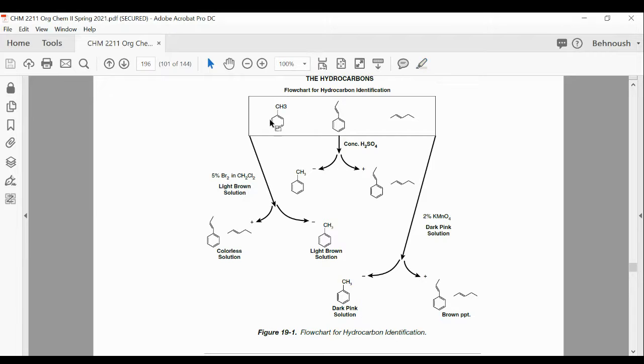With the permanganate, it is coming from the top list. With the permanganate, only the ones with the double bond would react, and if it's an aromatic compound, it doesn't. For bromine, same thing. The alkene would react with it, aromatic doesn't.